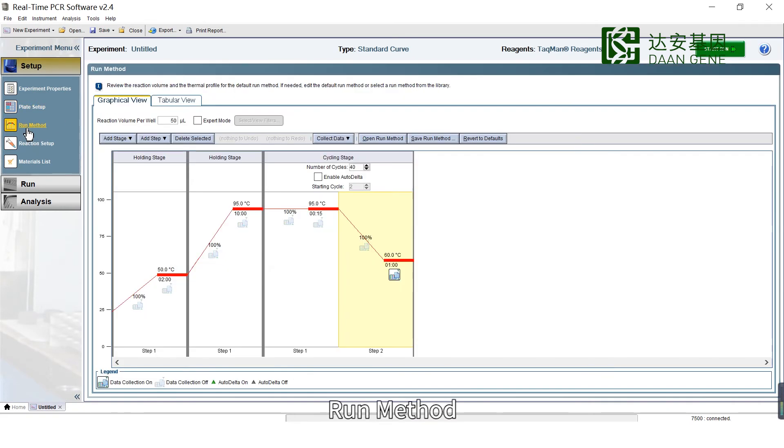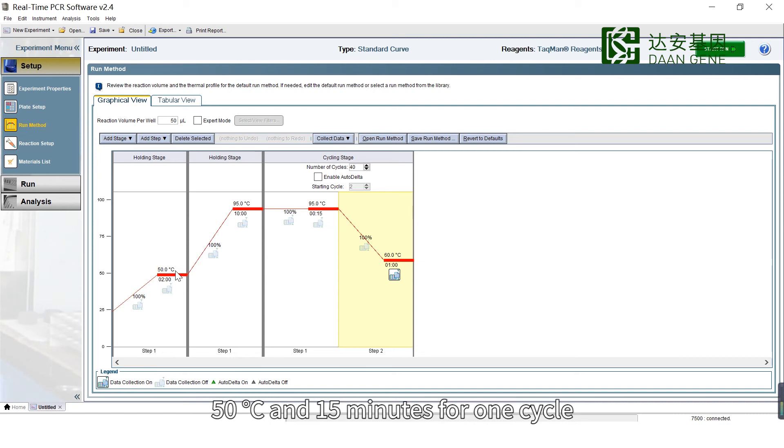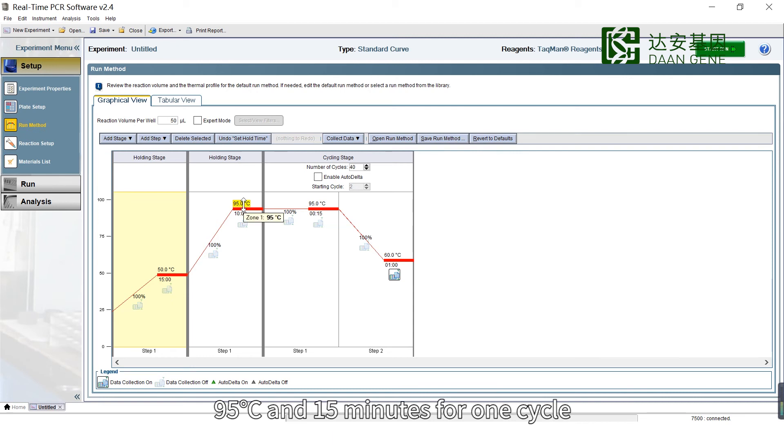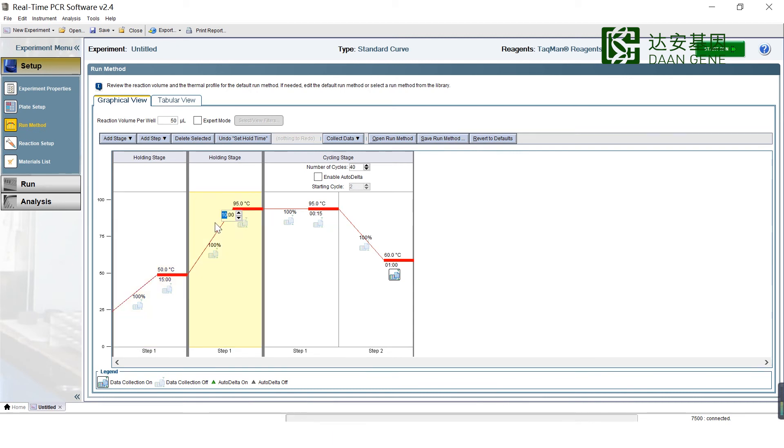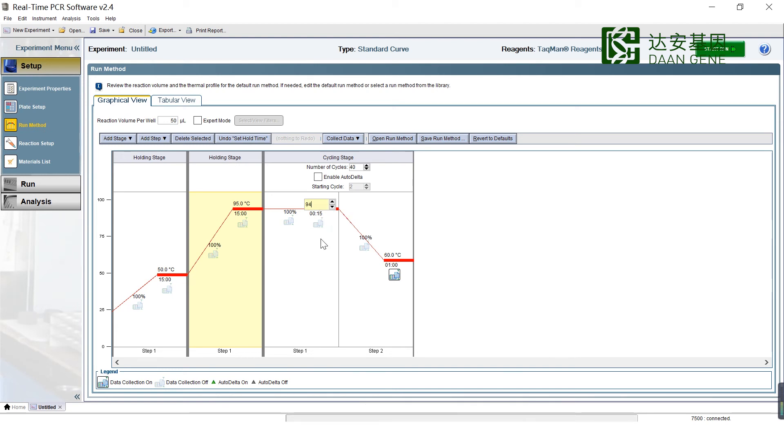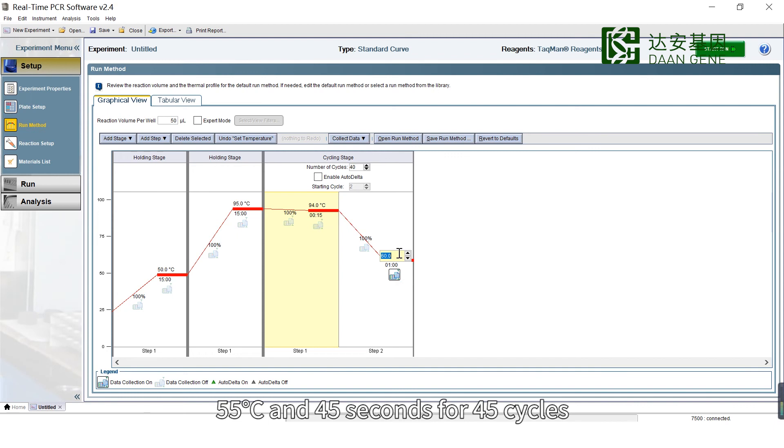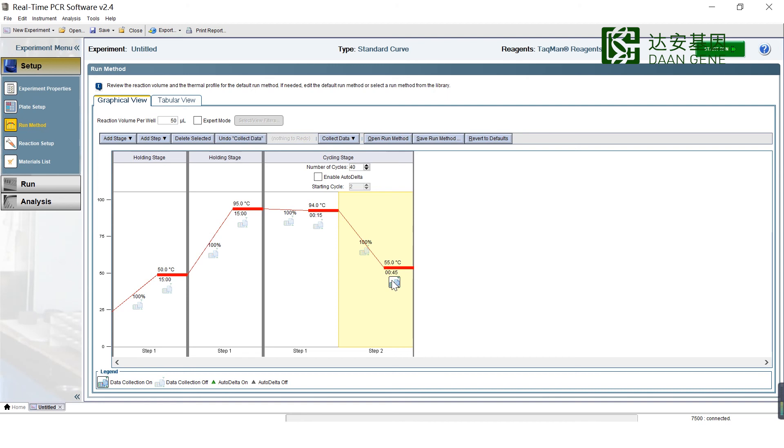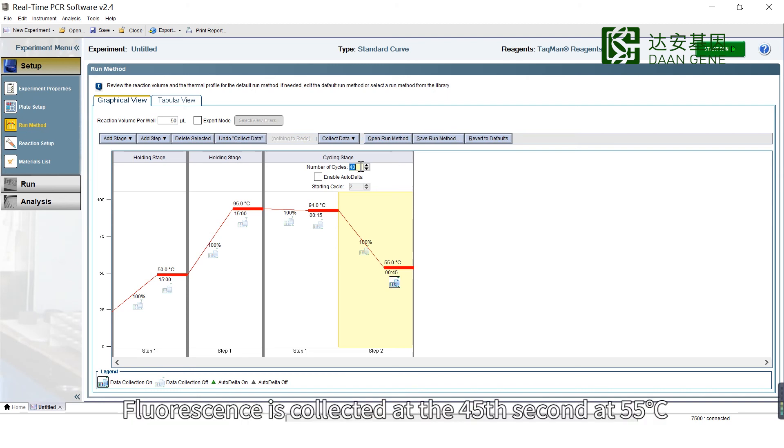Run Method. Configure the thermal cycling protocol: 50 degrees for 15 minutes for one cycle, 95 degrees for 15 minutes for one cycle, then 94 degrees for 15 seconds and 55 degrees for 45 seconds for 45 cycles. Fluorescence is collected at the 45th second at 55 degrees.